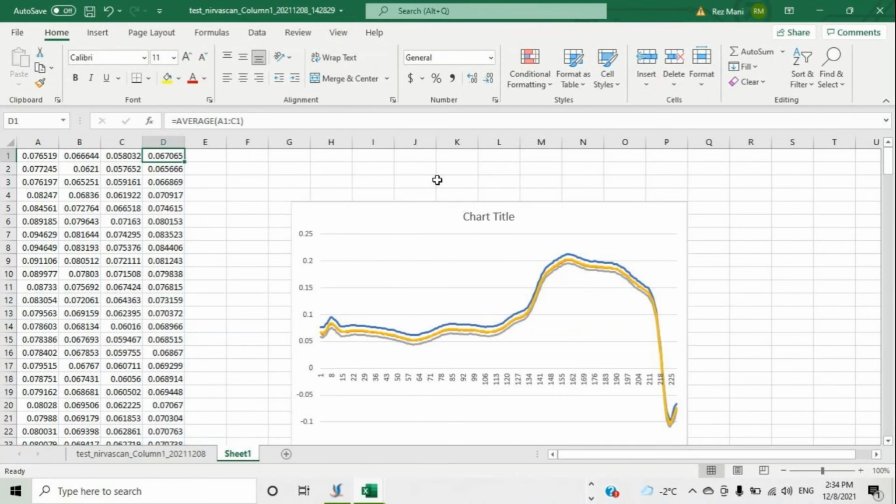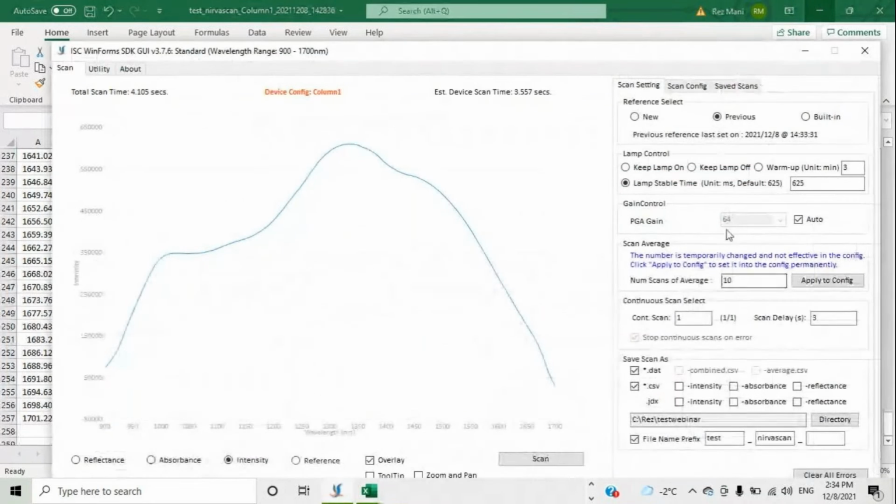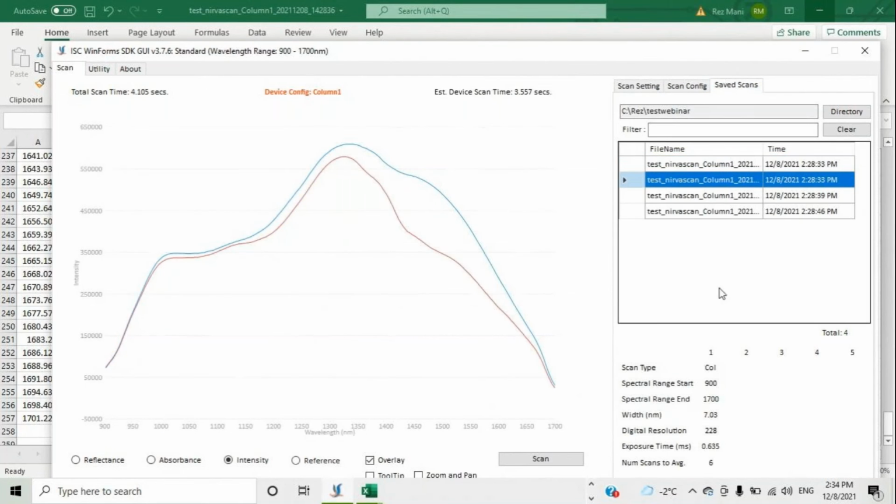Or you have to write a program that averages them. This one is only for one measurement. It does 10 measurements every few milliseconds and averages them. So the one plot that is produced is basically just the average of 10 quick measurements that was done.